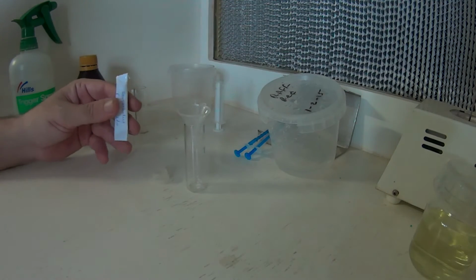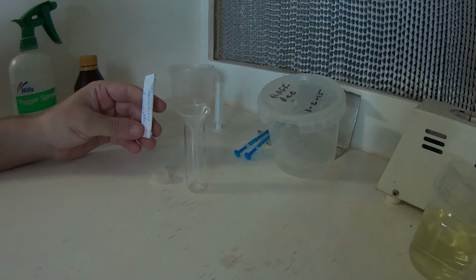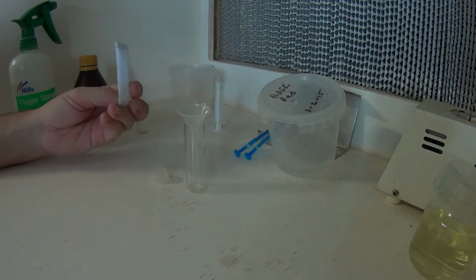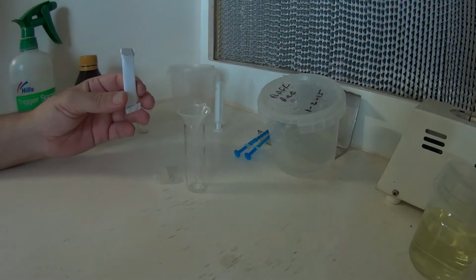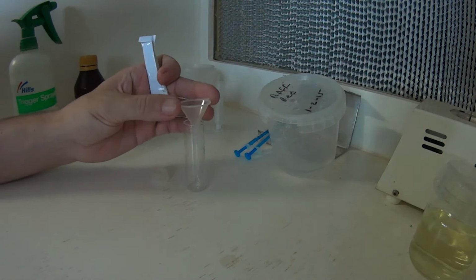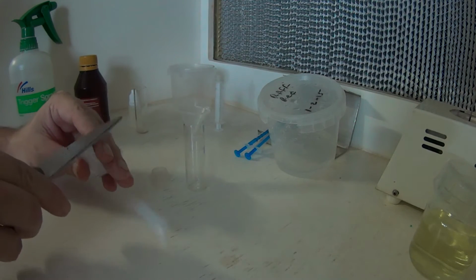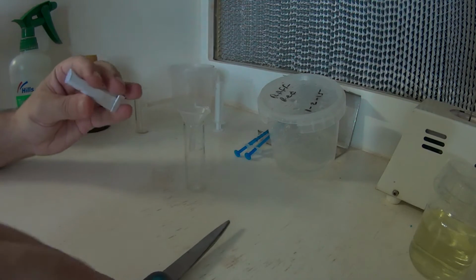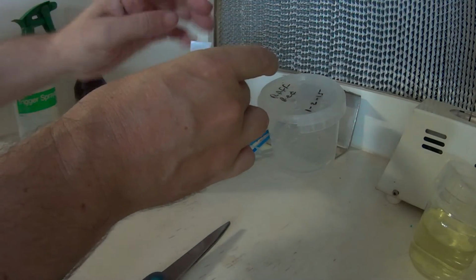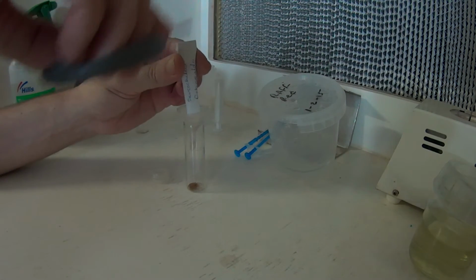Okay, in this video I'm just going to show you how I go about introducing orchid seeds into tissue culture. Inside this little paper envelope is some very fine seeds. What I have here is a tiny little funnel so I can get it into the glass tube. Just bear with me while I hopefully get it all in there. There we go. Like I said, it's pretty fine, so you don't have to be too sterile at this moment.